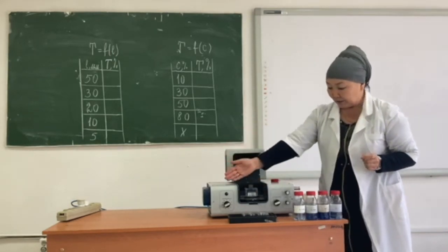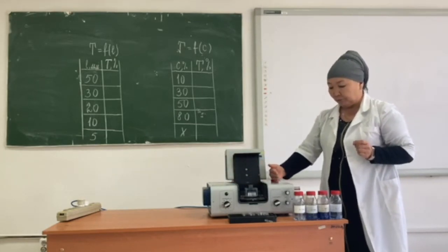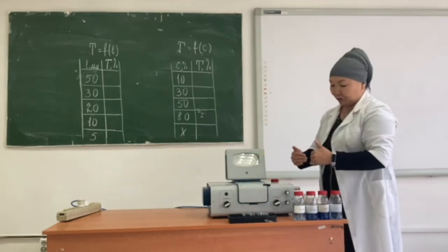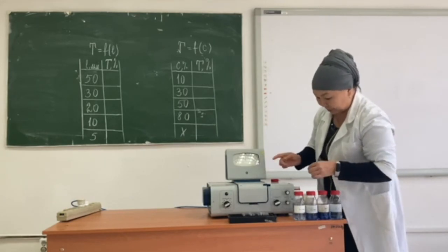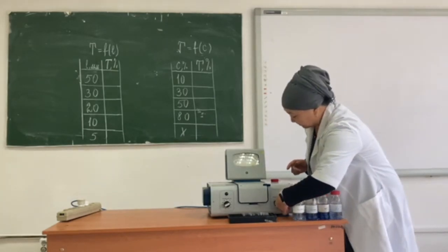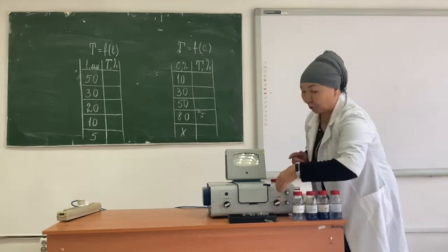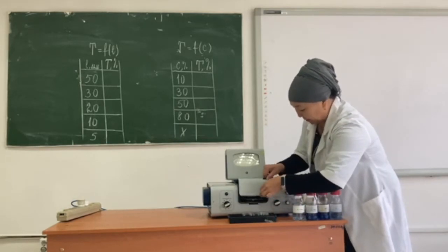The light passing through the filter passes through the water and falls on the photocell. The photocell converts the intensity of light falling on its surface into electrical energy, which in turn deflects an arrow on the scale. Since we are using the comparison method, assuming that when there is no light absorption through clear water, we set the arrow to 100 with the screw.